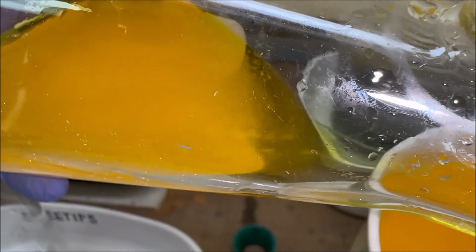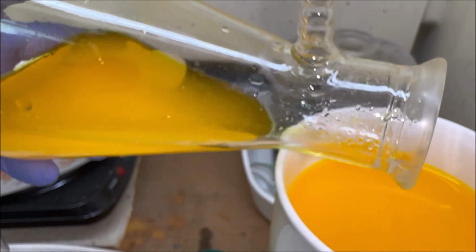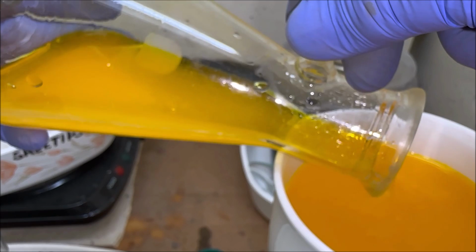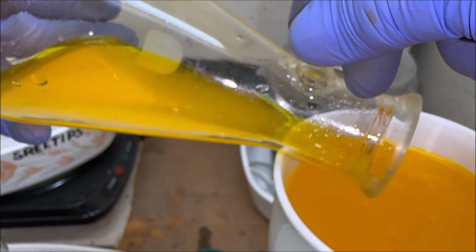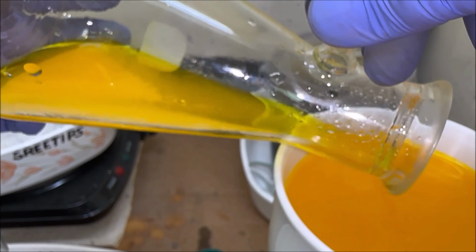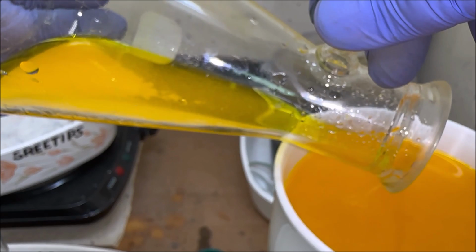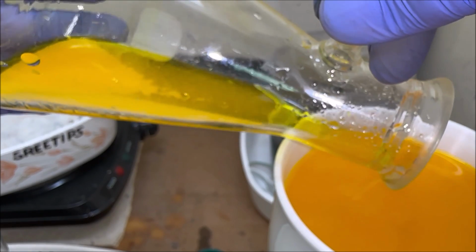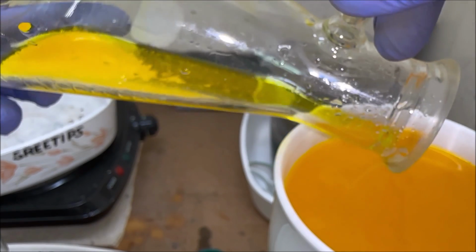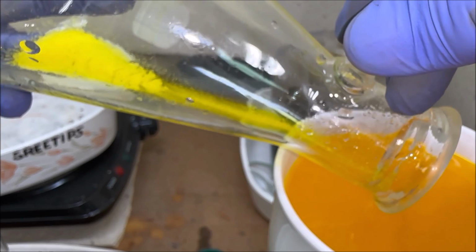And I don't think it's going to be silver chloride because I boiled that so long in the nitric. And this stuff came out of solution. Look at all of it when we added the sulfuric acid. So that's going to be our lead sulfate, that white material right there in the bottom of that flask. Nice. Glad I did this to see what we can get when we add that sulfuric acid.